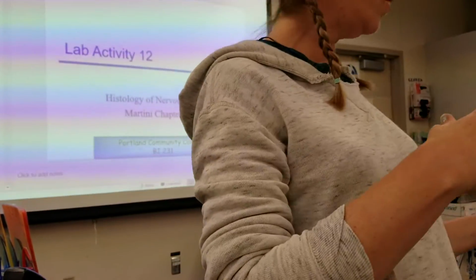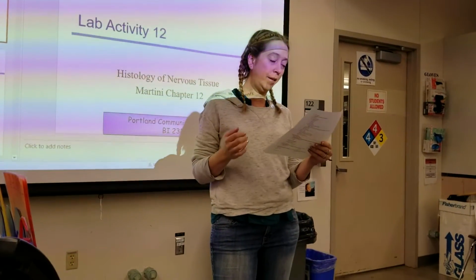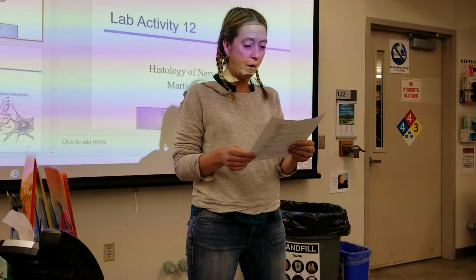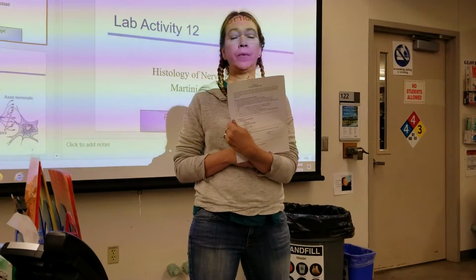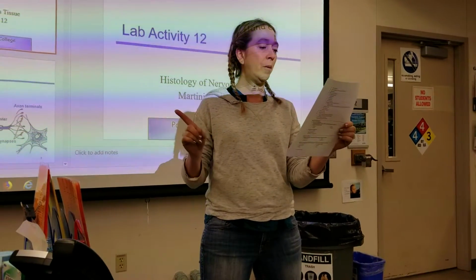Okay, so we're gonna go over about 3 different exercises for 231, for the end of 231, and then I'm gonna do 232 as well today. So the first exercise is the histology of nervous tissue. So really quick, there's a couple things I see in here.